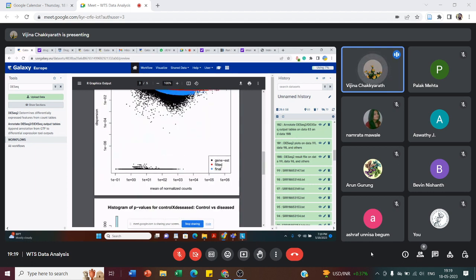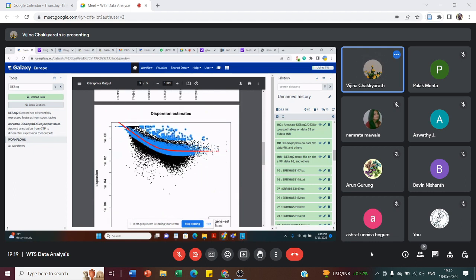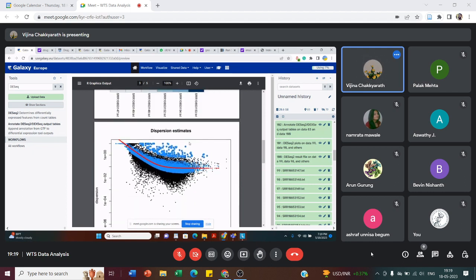Then next are scatter plots. This type of plotting uses dots to represent values for two different numeric variables.